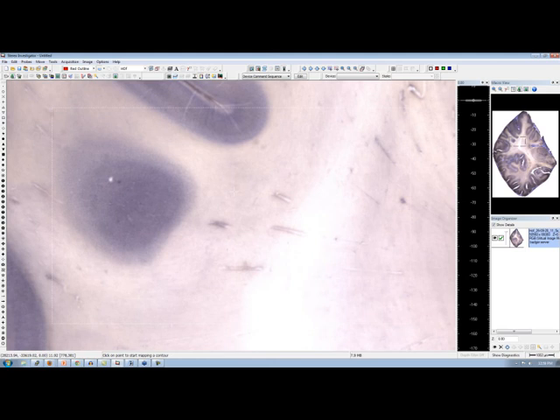If you have a data file, you can open up as many images as you want from Biolucida. You save a data file. You can do your tracings, place markers, everything you'd expect. Save your data file. The next time you open that data file up, if it's a Biolucida image, you'll be prompted to log in if you're not logged in, and it will just open up.